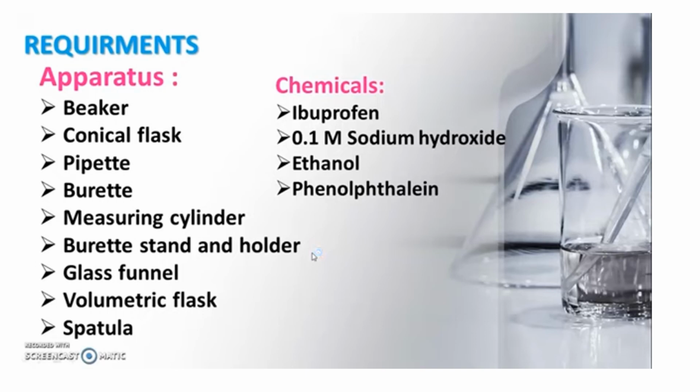And the burette, a very important piece of equipment here, is the glassware burette, which is used for titration. As you can see on the thumbnail of this video, the burette is used for filling the chemical for titration. And a measuring cylinder of different sizes can be used for measuring the volume of different liquid solvents.